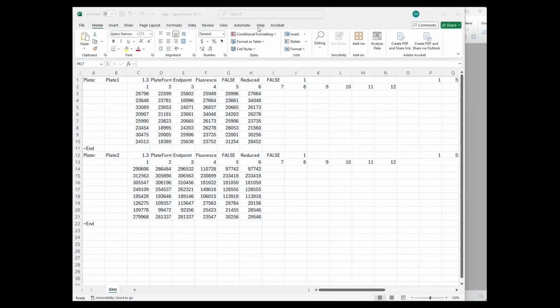So today we are going to go through the data analysis for a receptor binding assay. When you read your plate, it comes out something along these lines. It just depends on what your plate reader's output looks like. But as you can see here, the first set up here is the background for the plate. So I read it before I transferred the reactions to the wells.